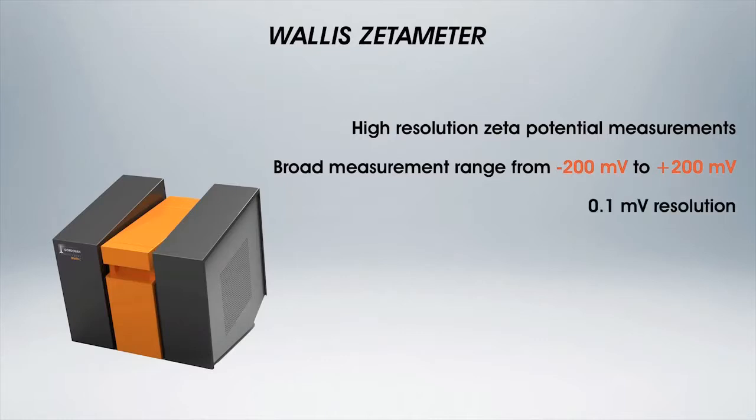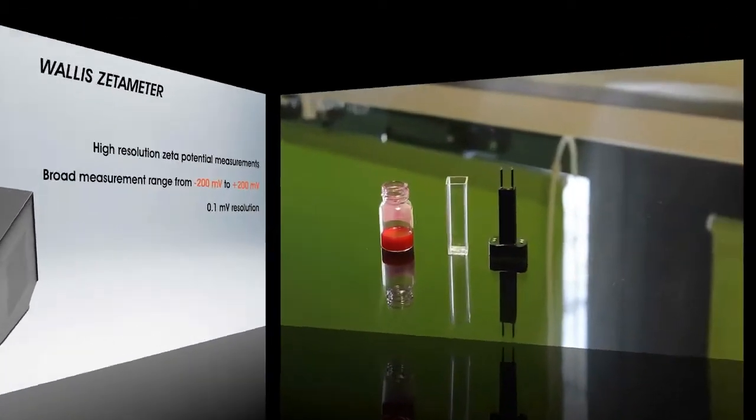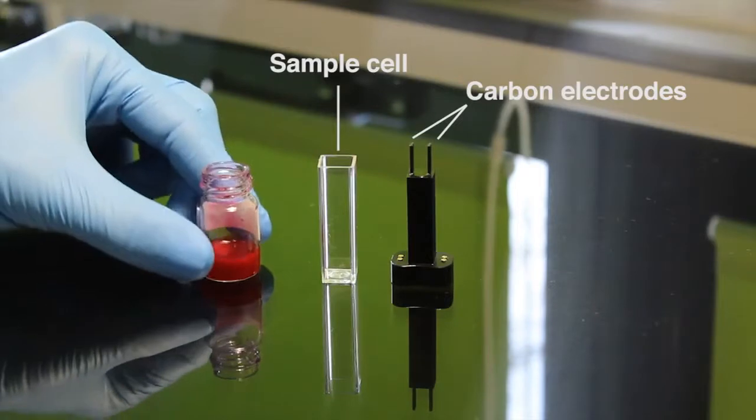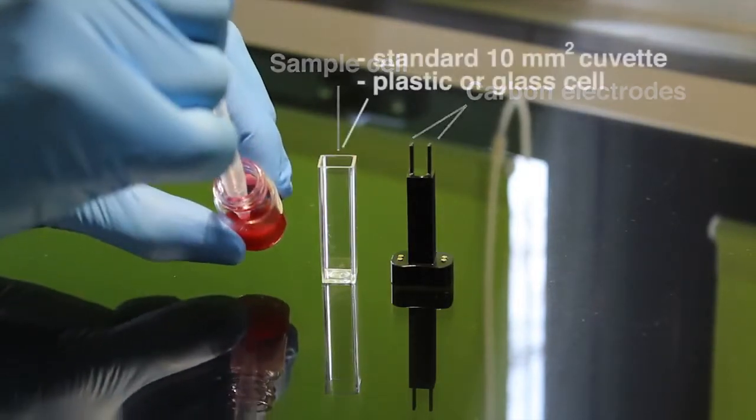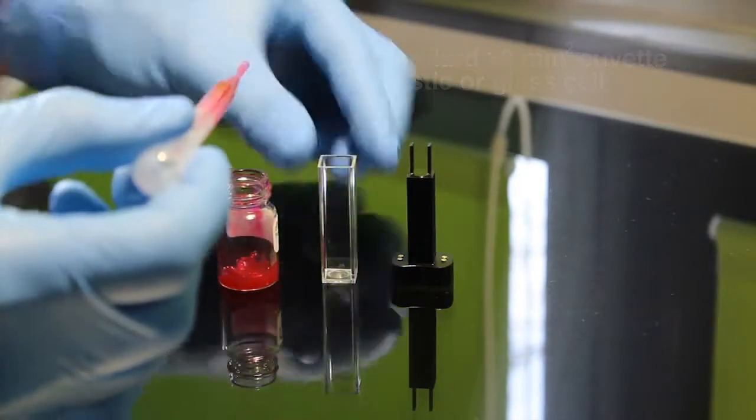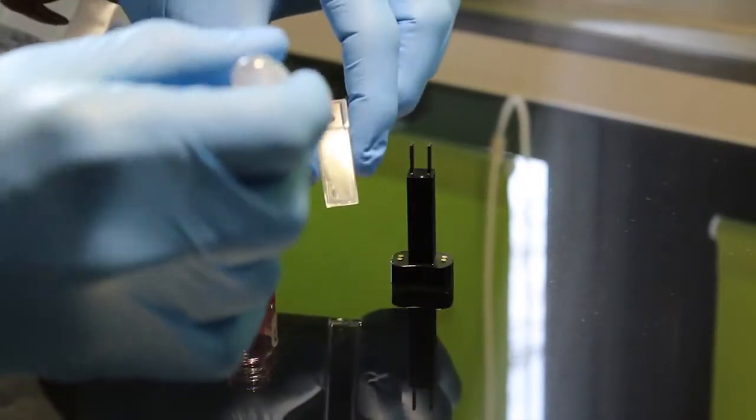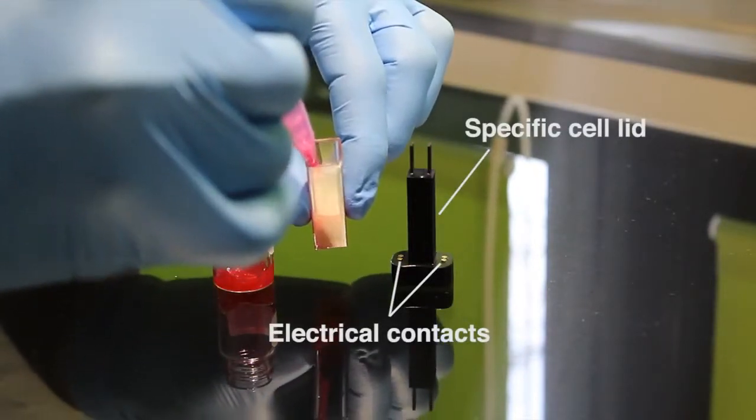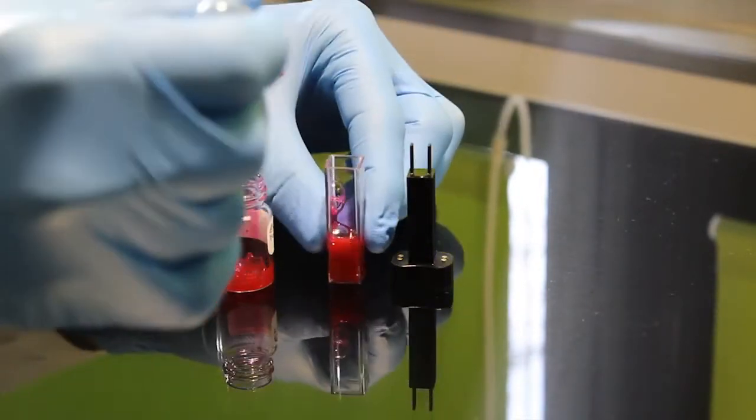One key part of Wallace is its measurement cell based on a dip cell design combined with high durability amorphous carbon electrodes. The sample cell is a standard 10 millimeter square cuvette, plastic or glass depending on the solvent. The electrodes are mounted on a specific cell lid with electrical contacts in order to apply an electric field in between when immersed in the cell.